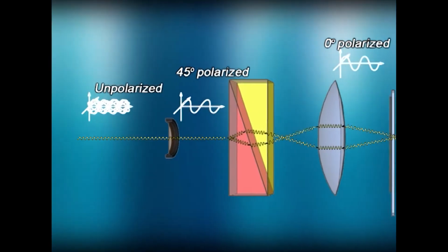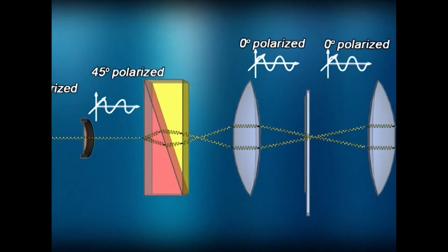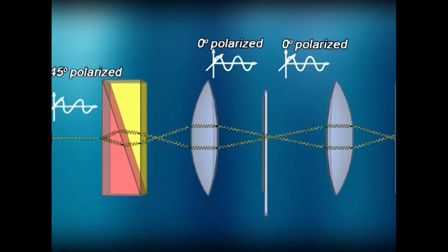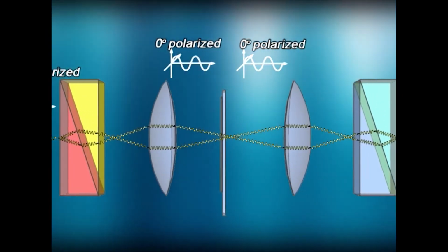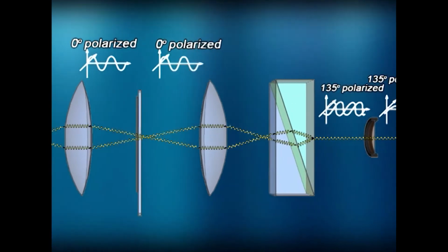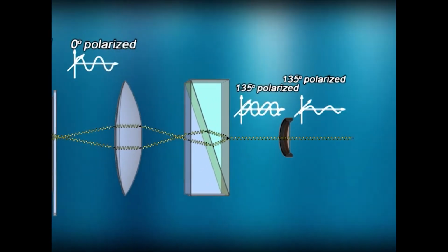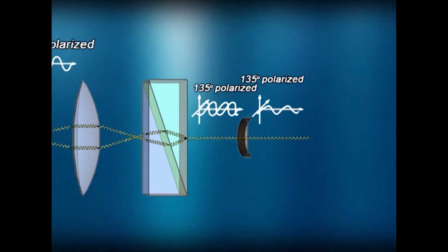The vibration planes of the two polarizing prisms, polarizer and analyzer, of a microscope are oriented to the cross wires in the ocular, with either the vibration plane of the polarizer or of the analyzer coinciding with the vertical or horizontal cross wire. The magnification of the ocular is usually marked on the metal case of the ocular and ranges from about 2x to 16x.